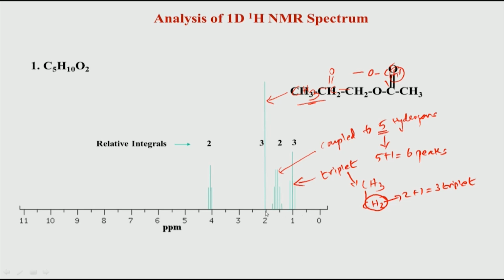If you look back at the slide where we looked at the chemical shift dependence on the carbonyl of the protons, because of this electronegative CO, this CH3 peak, which normally should come somewhere between 0 to 2, comes at the edge of that, a little bit downfield.